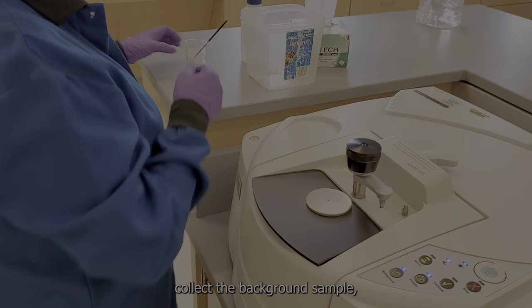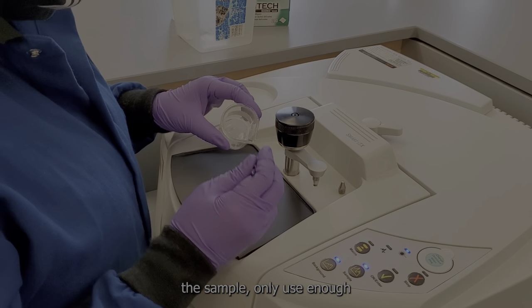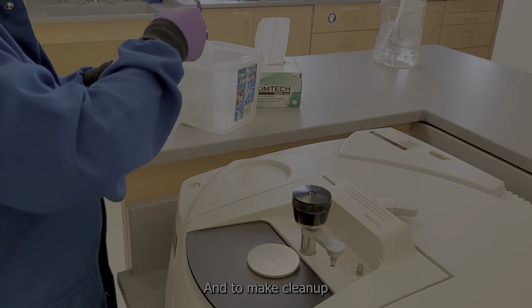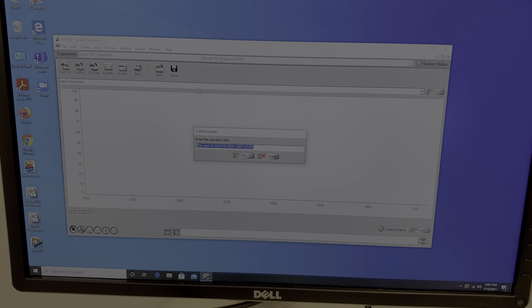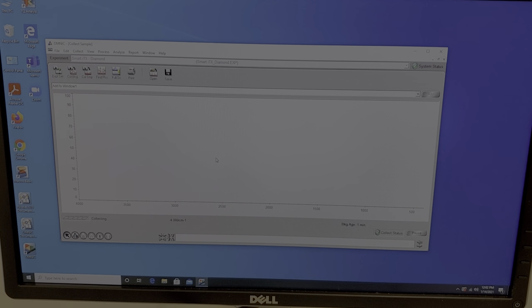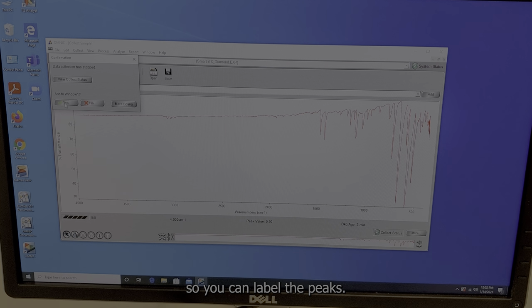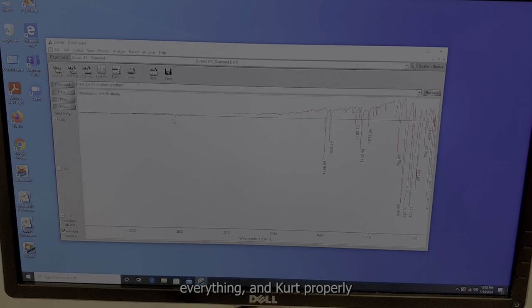Remember, you do not have to collect the background sample, you just have to take the reading. And remember, when measuring out the sample, only use enough to cover the pedestal. To make cleanup easier, please use the paper as well. Do not over-tighten it as well. After your measurement is taken, ensure that you find peaks so you can label the peaks. This is essential for you to identify everything and properly characterize your molecule.